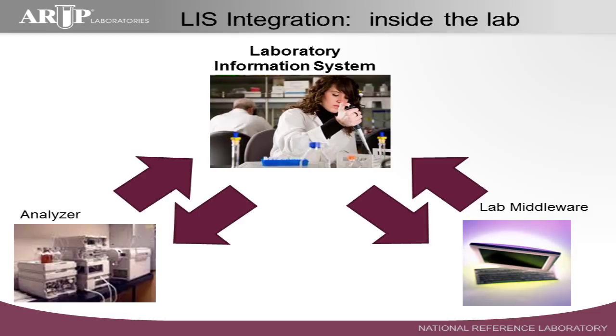And we interface quite a few of those. As a matter of fact, we actually develop a lot of our own middleware at ARUP. We purchase some of that and we develop some of it in-house also. And it's very important to get that interfaced into the LIS. So we're pushing orders down to these devices in the software, and we're receiving results back. That's typically what we're doing.